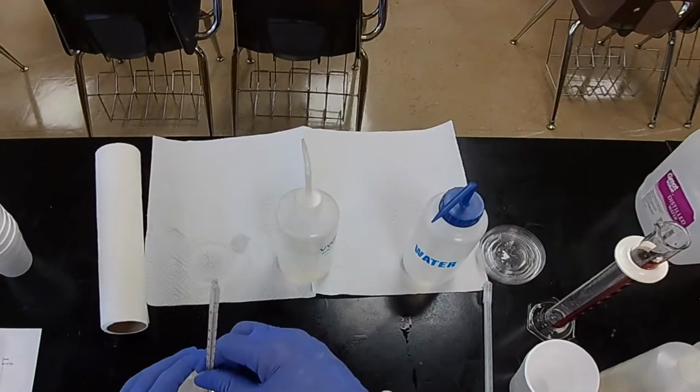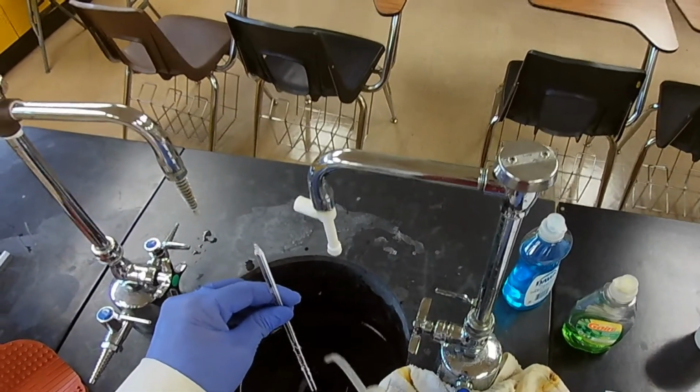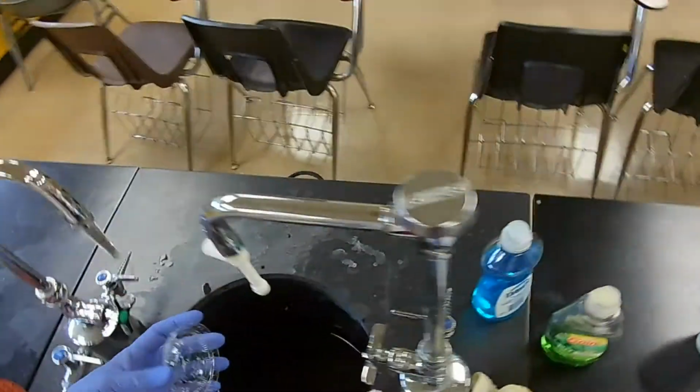All right, what's called for first is the cleanup. And let's clean off any splatter.